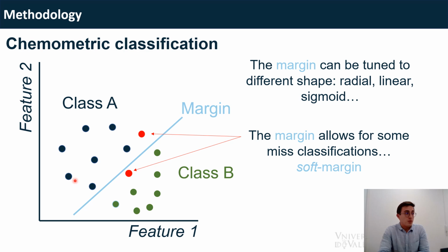So then basically what we will have is a model telling us that whatever sample falls here belongs to class A, which will be a pigment. Whatever samples land here, are found here, will be classified as class B, so that will be a different pigment. And these models will be built on the basis of the corrected CLF parameters.